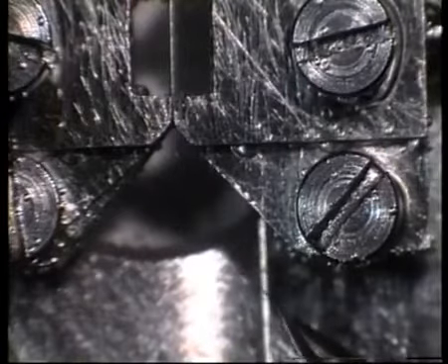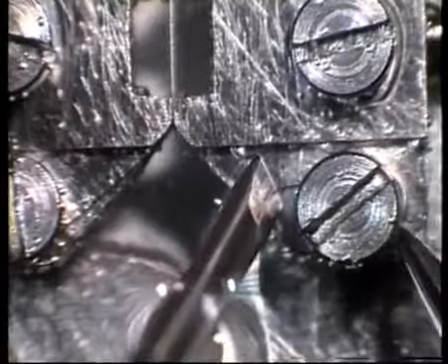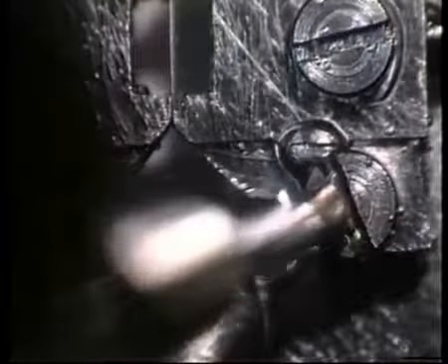Here the wire is bent around the screw and the screw tightened. Remember that the transducer is very sensitive to pressure at the transducer head, so do not use much force when you tighten the screws. This also applies any time you have the heads together. Do not turn the micrometer too far in.